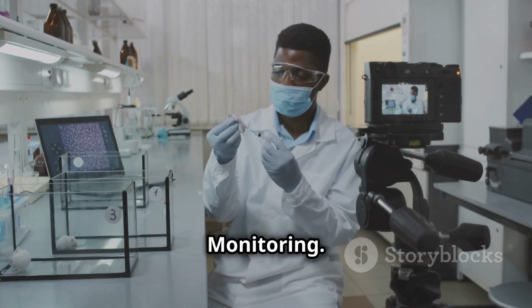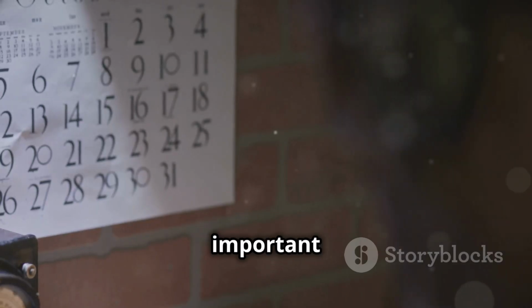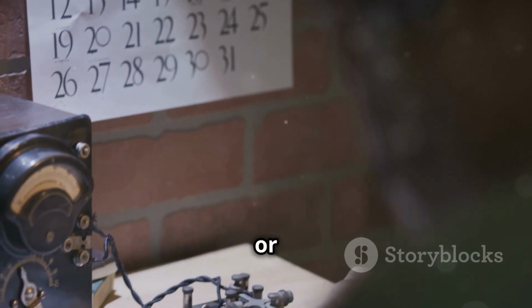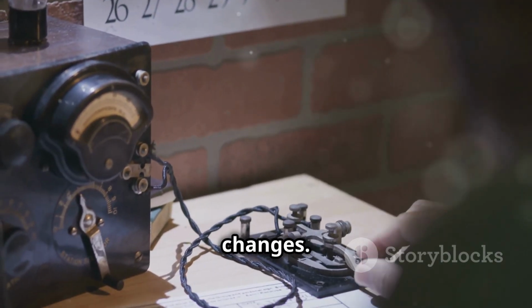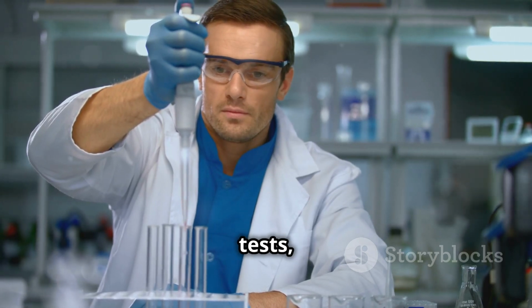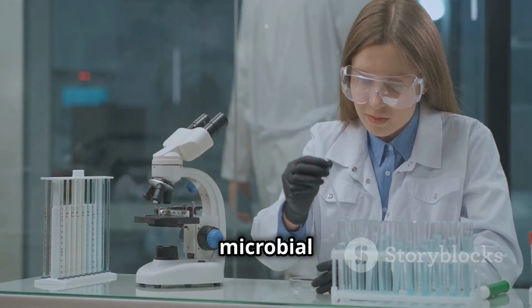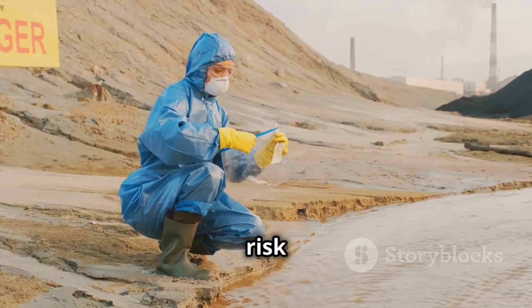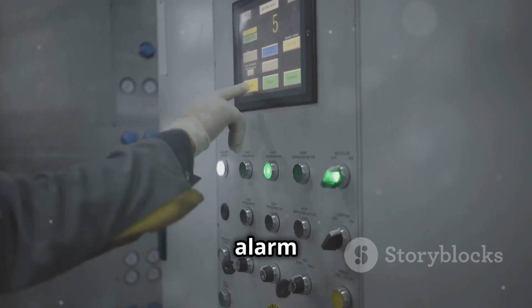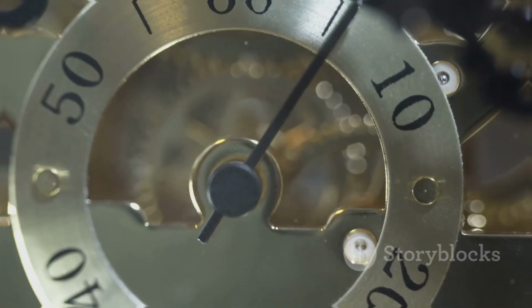Requalification and routine monitoring. First, let's talk about the requalification schedule. It's important to define routine requalification intervals, typically annually or after major system changes. Next, routine monitoring is crucial. This involves regular tests such as total organic carbon and conductivity on a weekly basis and microbial counts monthly, all based on a thorough risk assessment. Lastly, alarm management. You need to document alarm set points for critical parameters and clearly define response actions.